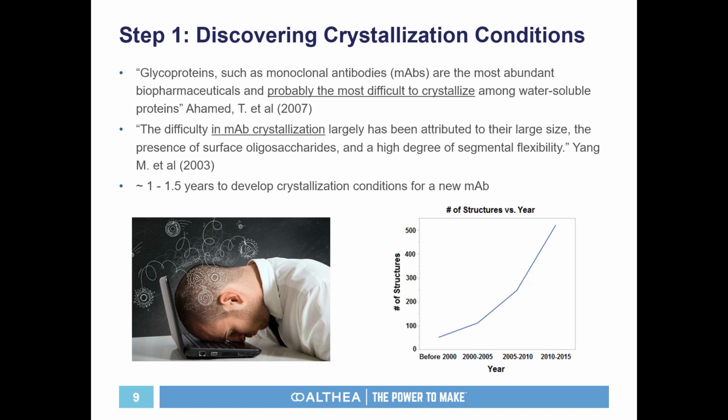So how do we get these benefits? Well, the very first step is to discover the crystallization conditions. Now, protein crystallization can be really tough. It's usually a very trial and error sort of process where you usually screen your protein against hundreds, if not thousands, of different conditions using different concentrations and pHs, buffers and precipitants, and it's actually really tough.